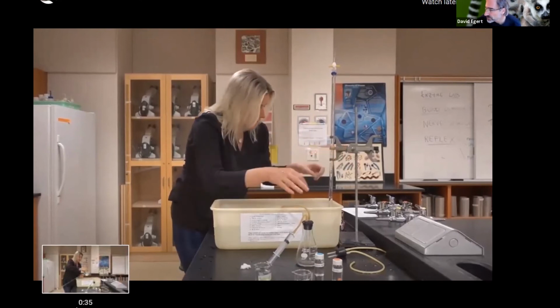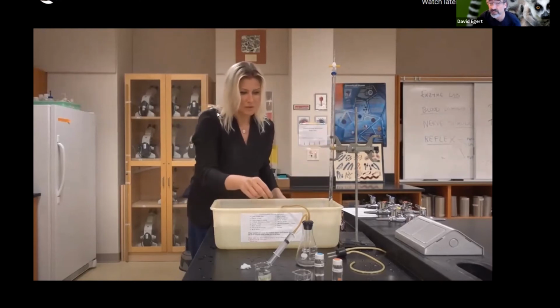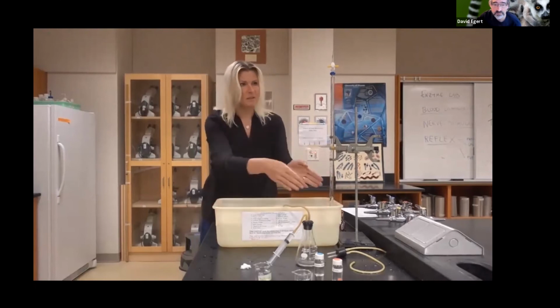Like that. Right, it stays up, kind of like when you put your thumb on the top of a straw and you can lift the water up, right? So as long as the top is sealed, it creates a vacuum where the column of water stays up the tube there. That will be a good position. Also, so we don't need to stretch the tube, you can scoot the bath a little bit closer.